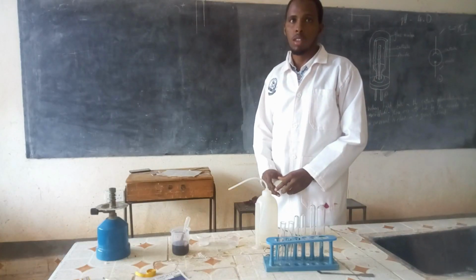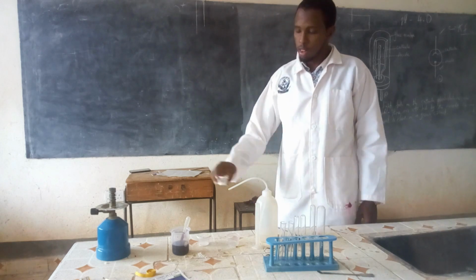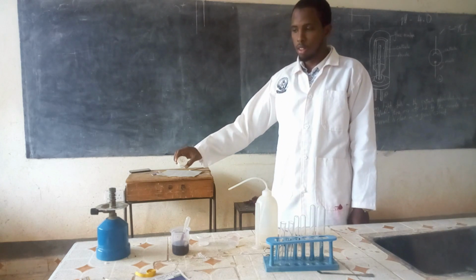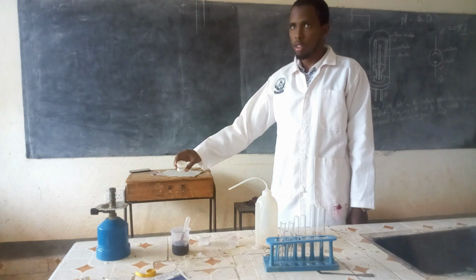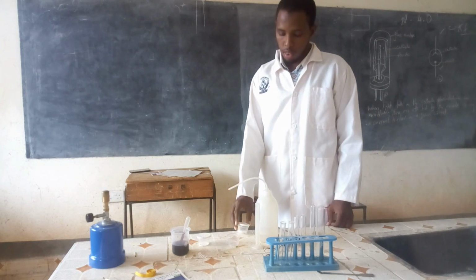Welcome, viewers. In this lesson we are going to analyze solid V. This analysis we call organic analysis. This one is being done by a student, that's Adam.